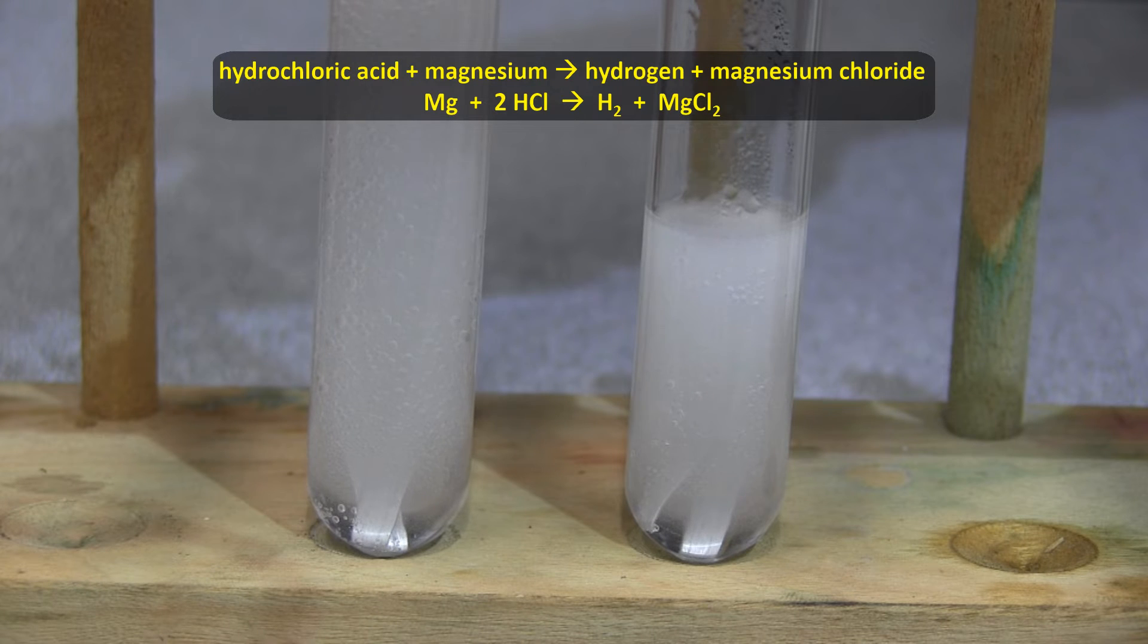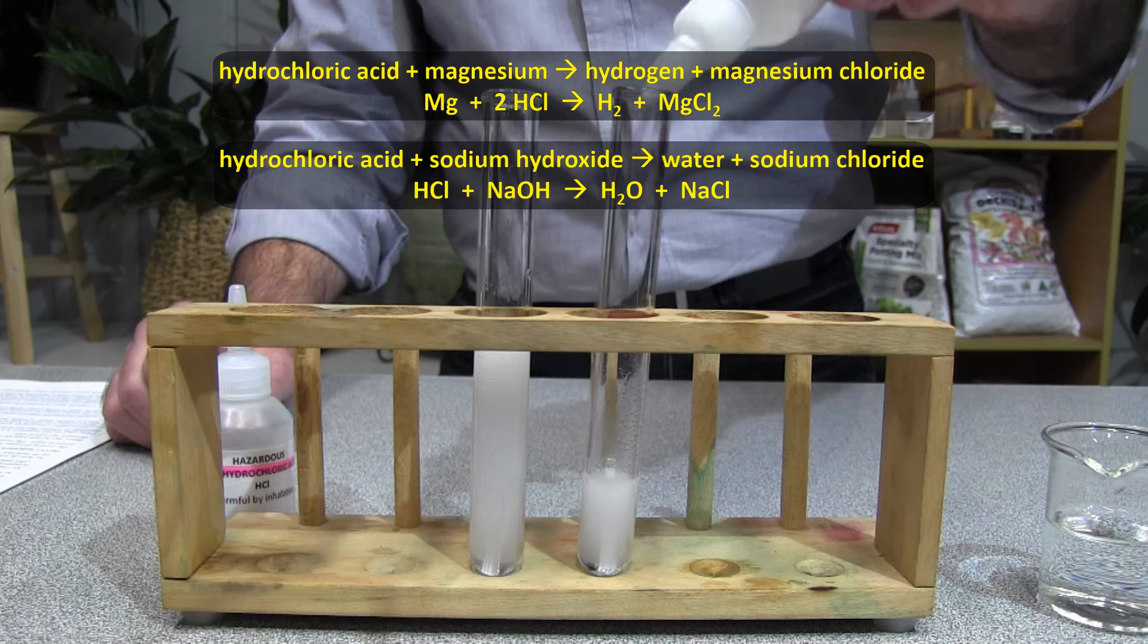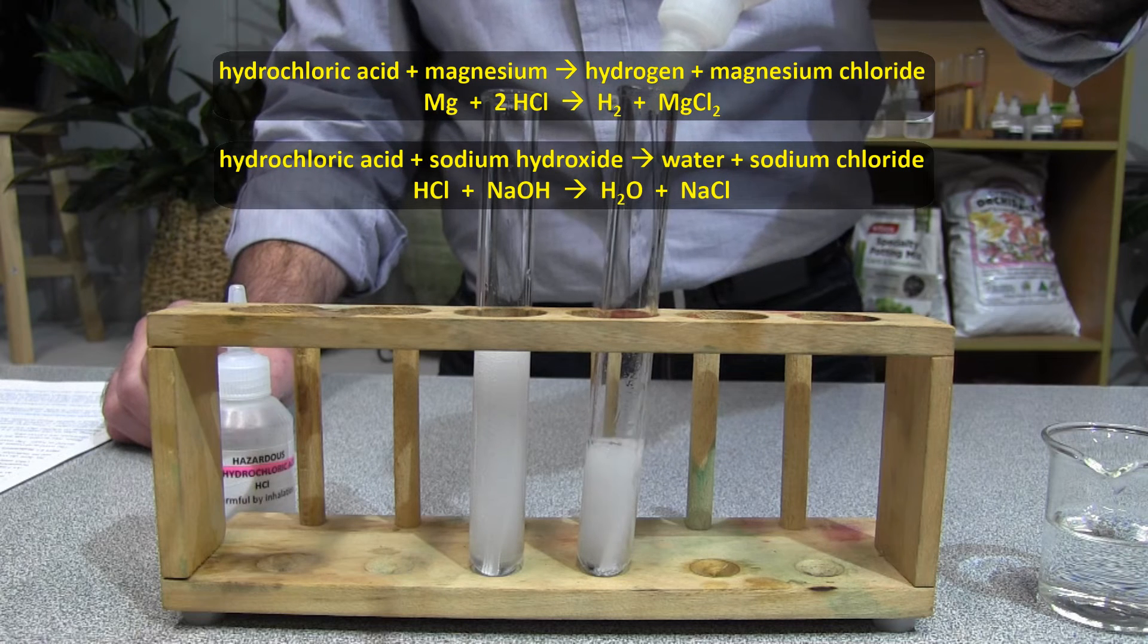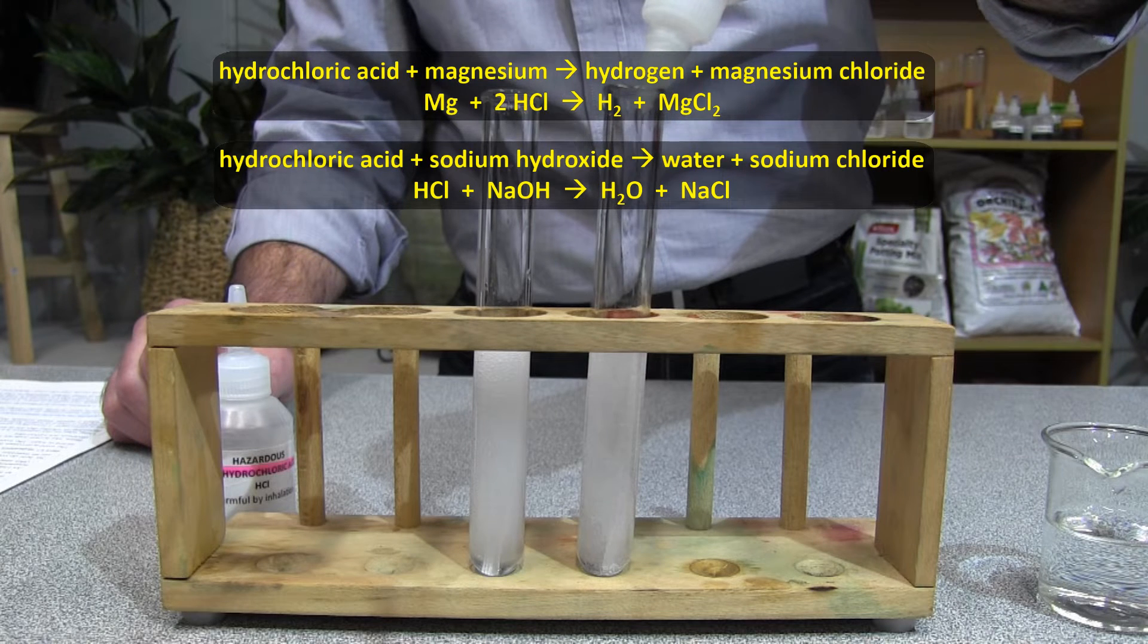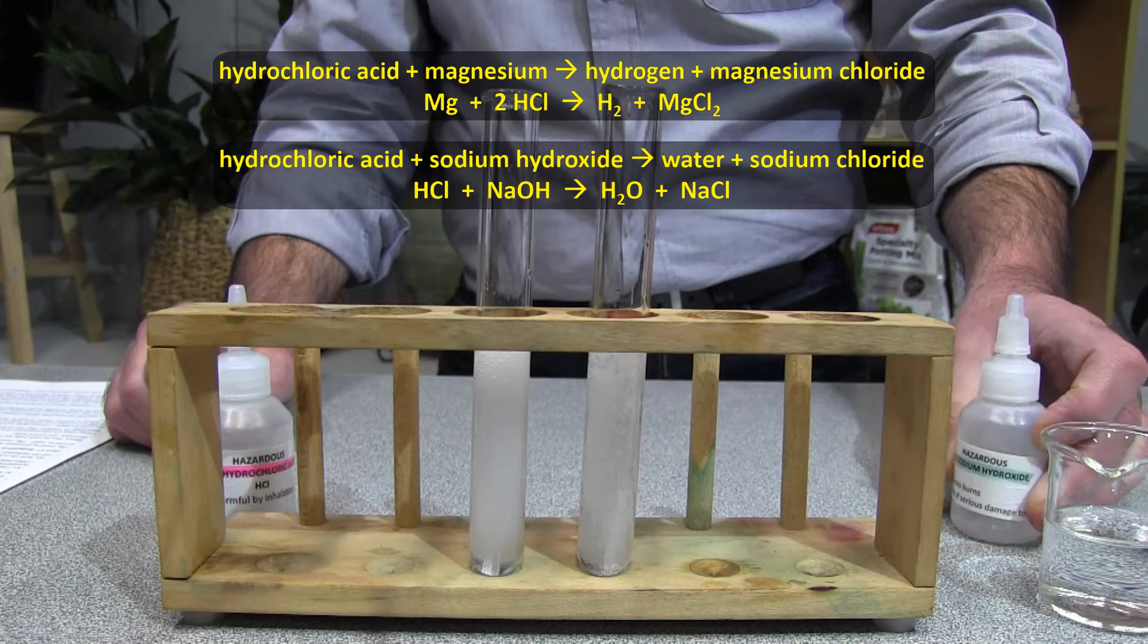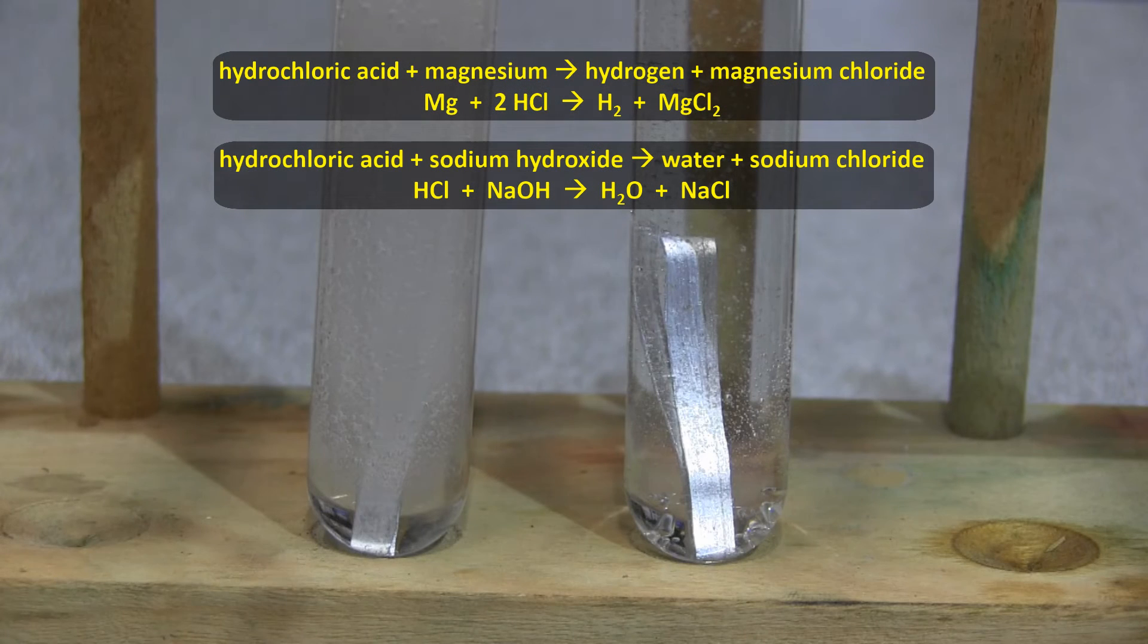Now, if I add some sodium hydroxide, a base, into the test tube on the right, the hydrochloric acid immediately reacts with it and water and sodium chloride are produced. The Mg is not producing bubbles anymore because there is literally no acid in the test tube anymore.